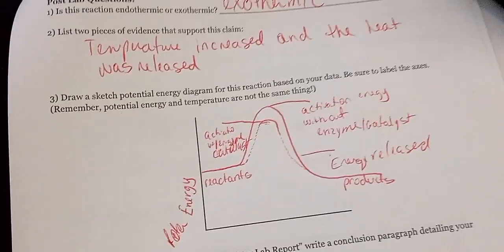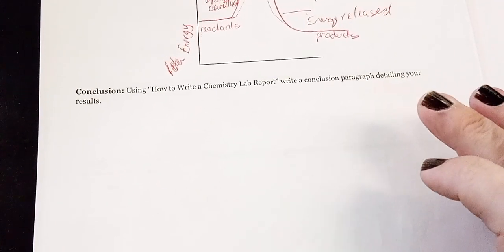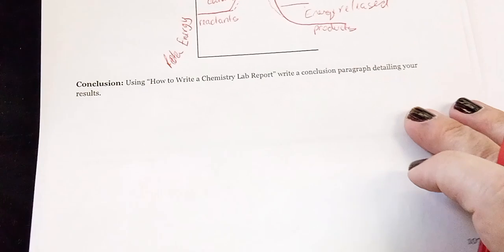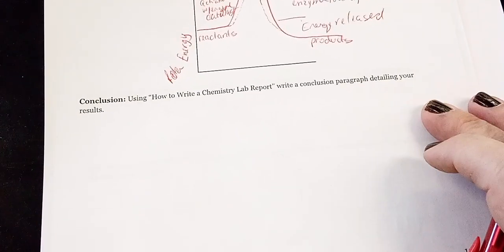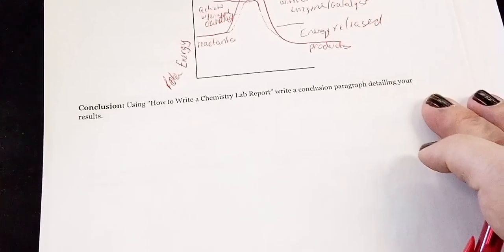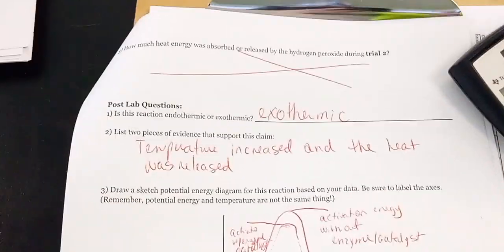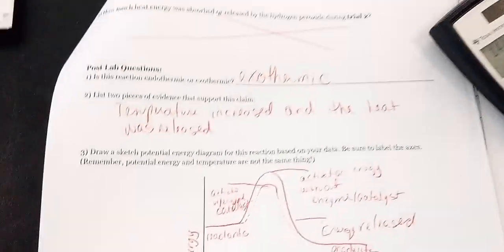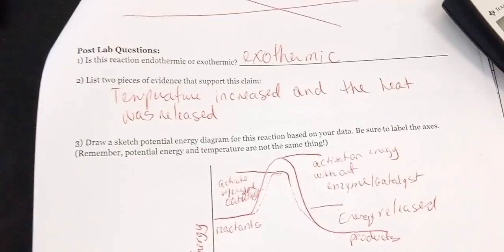Now you're going to write in your own words a conclusion to explain your results, what you expected, whether you expected anything different, and what you learned from watching these experiments. As you can see, we have learned that the decomposition reaction of hydrogen peroxide with yeast is an exothermic reaction.